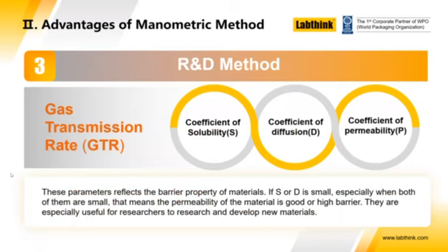So some people tend to refer to this manometric method as a research and development method for the reasons which I previously explained. You can gather an awful lot of important data from using this manometric style equipment, such as those coefficients of solubility, diffusion, and permeability that I mentioned.